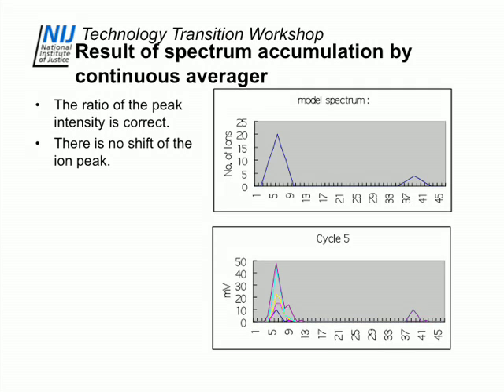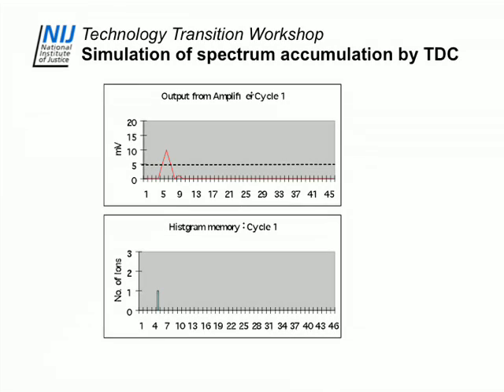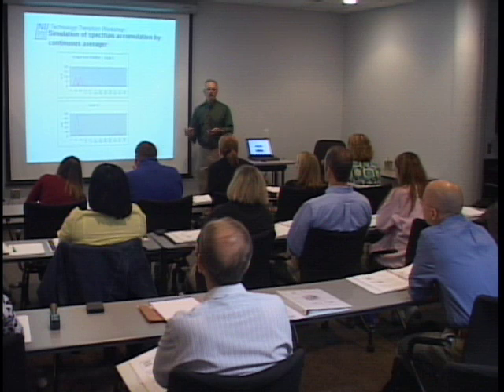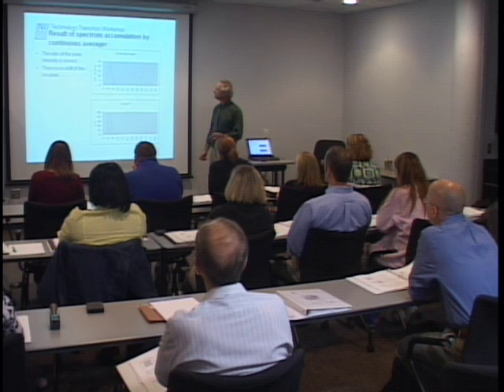So let's see, we're going the wrong way here. Let's back up. Okay, here's the first ion. Here's the next ion. And see, we're actually getting this little bit of ringing because the electronics aren't perfect. There's not a perfect impedance match at the end. So you get a signal and then you get a little recovery time. And that gets figured into the signal.